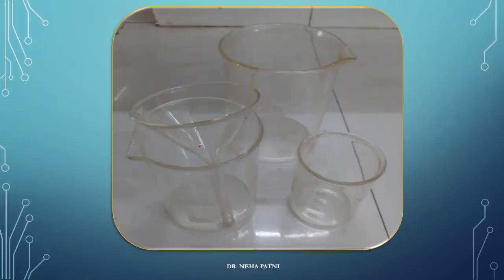I think you can identify that this one is a funnel. And these are nothing but beakers. They could be of any capacity — this is a bigger one, this is a smaller one. You can see it is 100 ml and this is 250 ml. So, beaker and funnel.